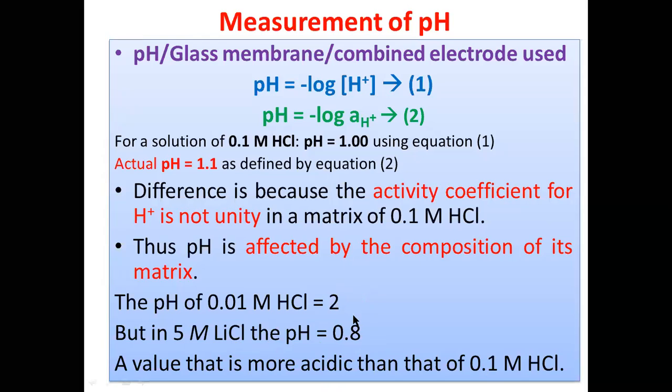Because of all these reasons, you have to calibrate the electrode properly. What is the solvent you are going to use to prepare the standards? The same solvent must be used to calibrate the instrument. It's very important to understand.